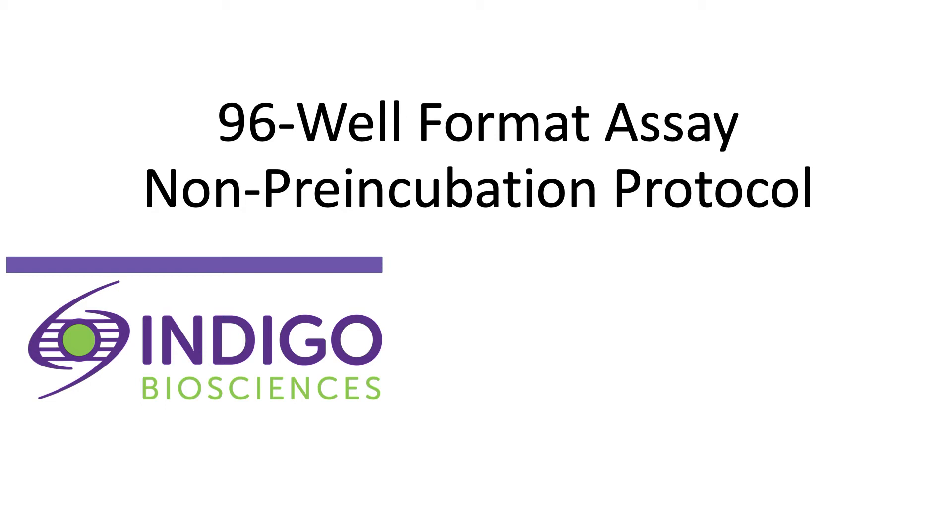Welcome to Indigo Biosciences Assay Tutorial. Indigo's assay kits are offered in 96-well, 3x32-well, and 384-well plate formats. The following tutorial demonstrates the use of the 96-well format assay plate.